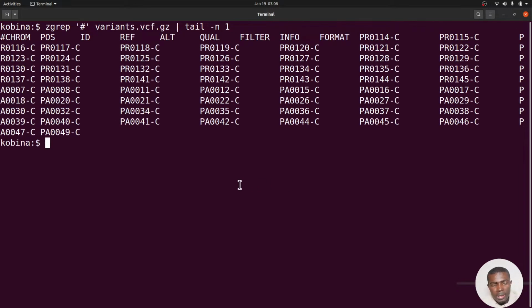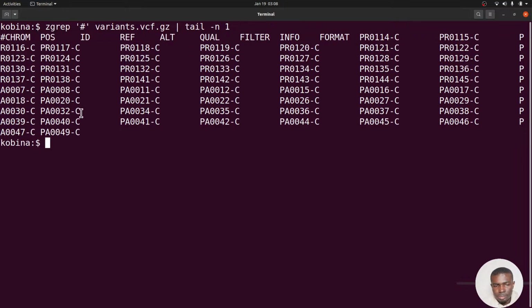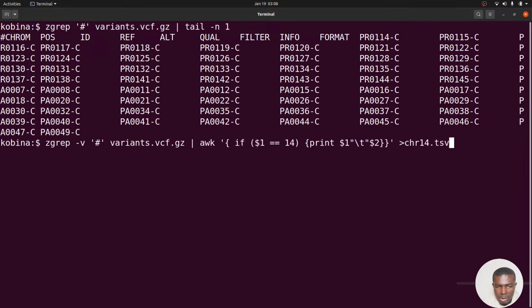Now let's say I want all the columns here. I have column 1, 2, 3, 4, 5, 6, 7. Okay, let's just say 7. This 7 up to this one here. Let's say I want all of them. Then you may be tempted to use the awk.